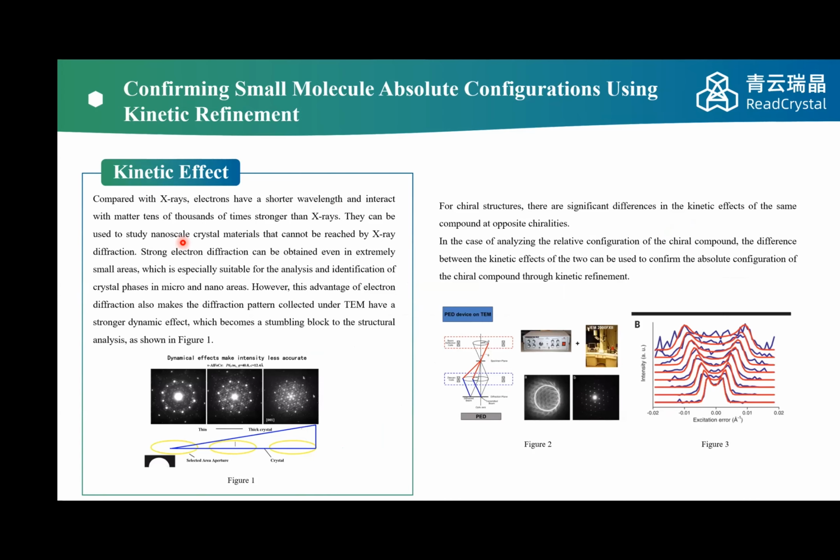So chirality, absolute structure, is another interesting topic for, for example, medicinal chemists. After synthesizing their target compound, they would really like to know the chirality of their compound. Normally, they have to grow a large crystal to do single crystal X-ray diffraction to determine the absolute structure. But with micro-ED, we can determine the absolute structure from just a nano-sized crystal.